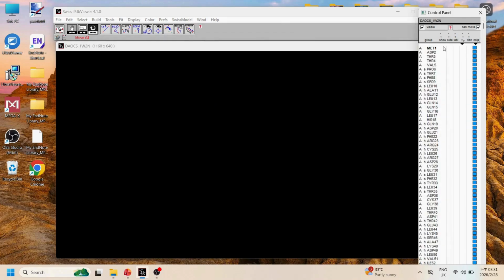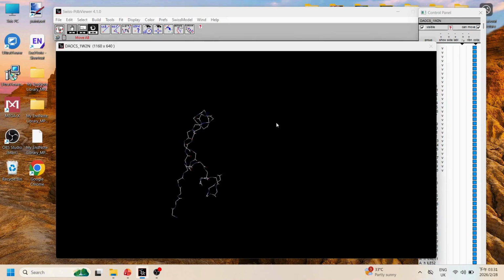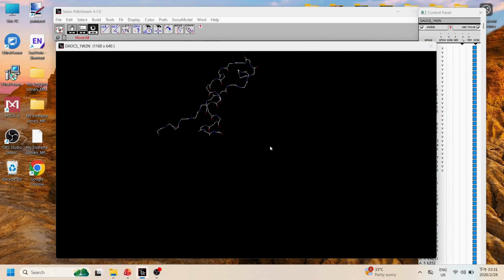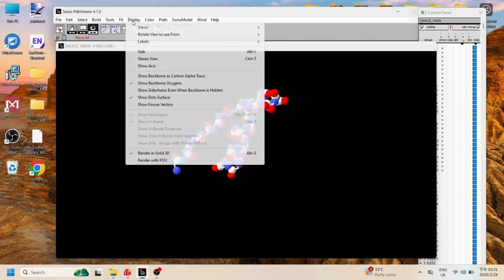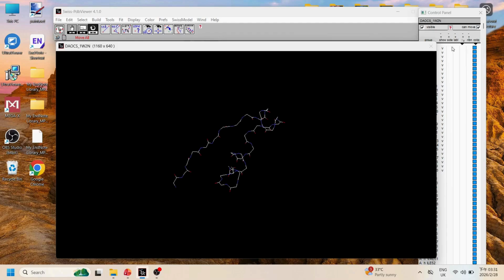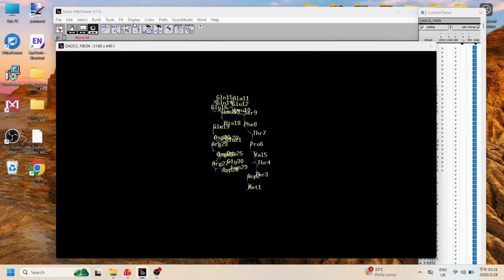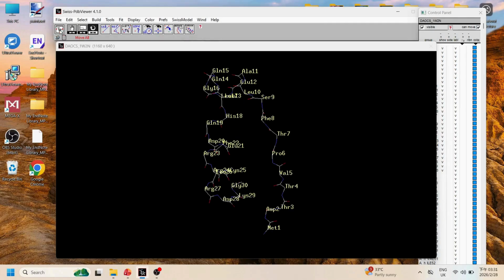As you learned in the earlier tutorial, now select the peptide fragment of your interest. In Swiss-PdbViewer, simply click on the residues or region you want to focus on. Now, let's apply the skills you learned in the earlier tutorial to manipulate and visualize the protein structure more effectively. Let's insert labels to identify important residues, chains, or regions in your protein structure.